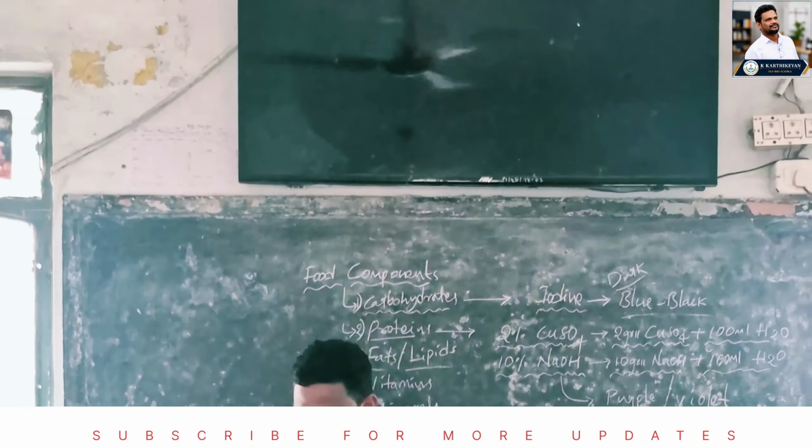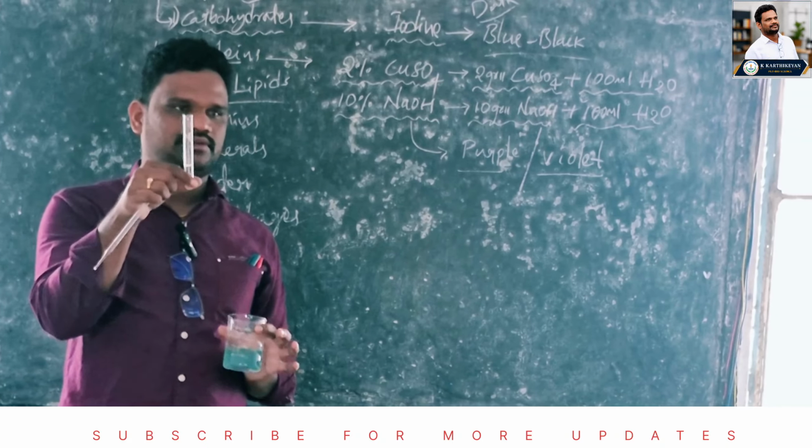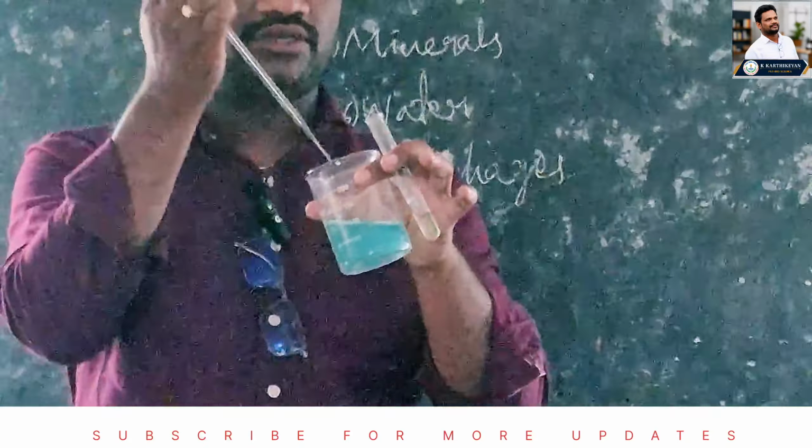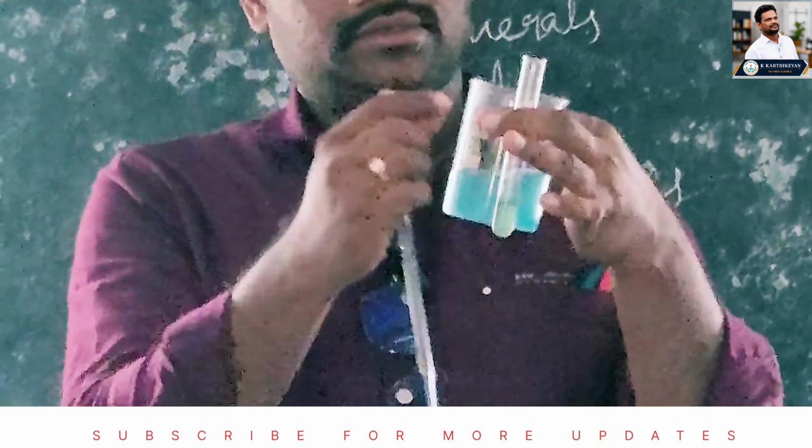Okay, now we have to add it into the protein sample. This is a protein sample, right? Now we have to add how much CuSO4? Only 2 drops. 1, 2. Only 2 drops we have to add into the proteins.